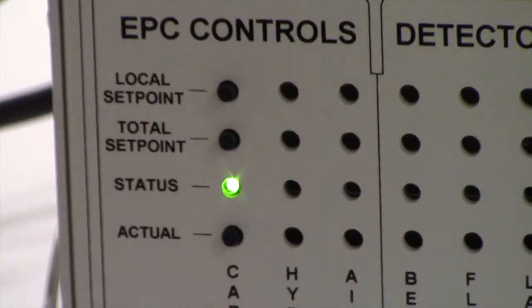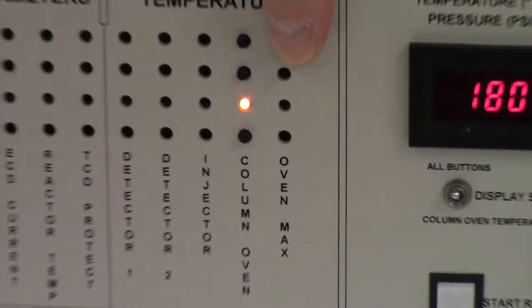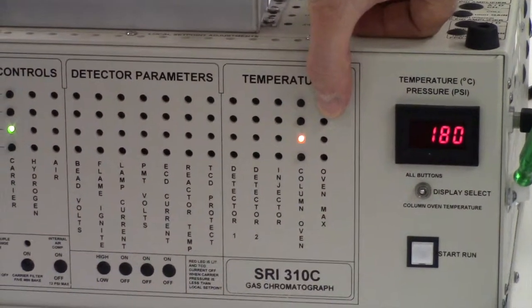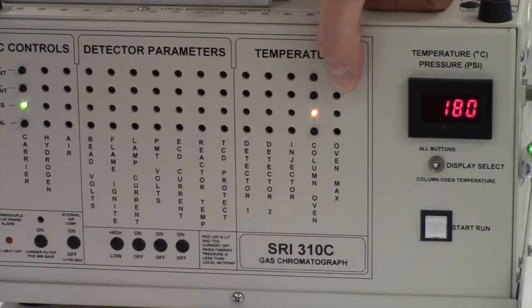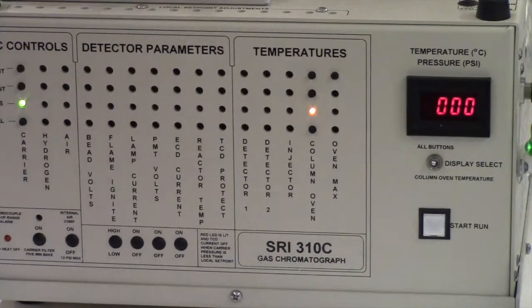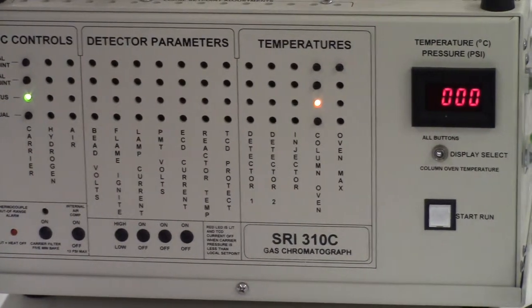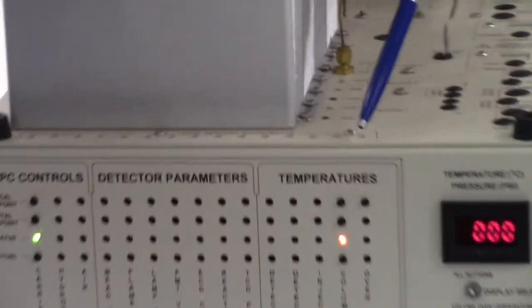After that, we have the temperature section. This button shows us the maximum temperature of the column, which again can be adjusted with a trim pot right there.